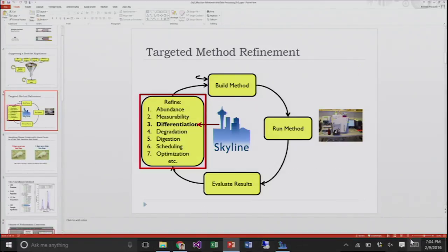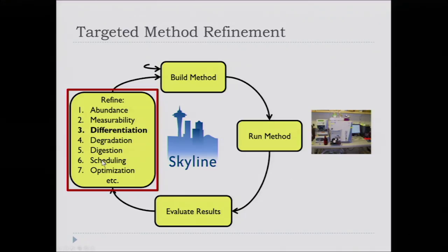One of the things that we typically measure, even for clinical assays, is degradation. Once we get interested in a set of peptides, we will make sure they sit in their autosampler vials for at least 48 hours, maybe 70 hours, at whatever temperature the autosampler is. Then we'll measure them at the start of that period and at the end of that period, and they should be very similar measurements. And if they're not, then they're not good candidates for a quantitative assay.